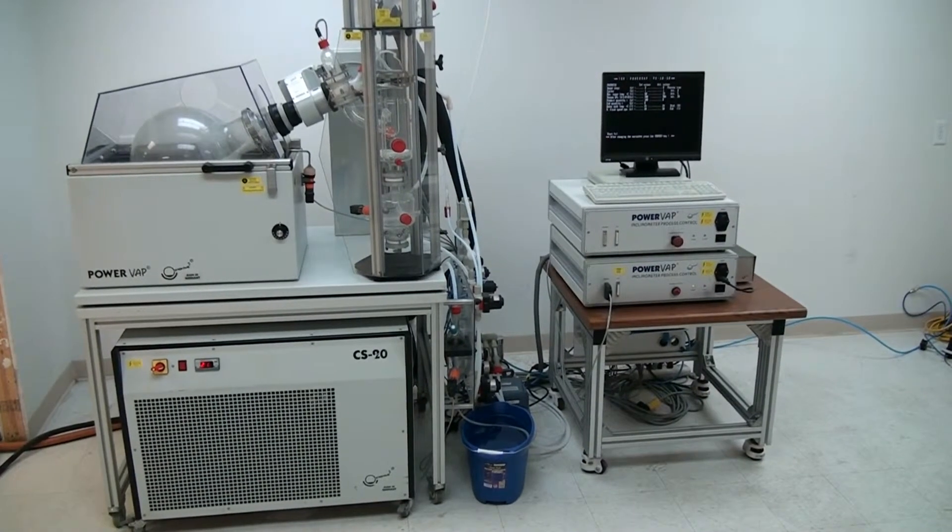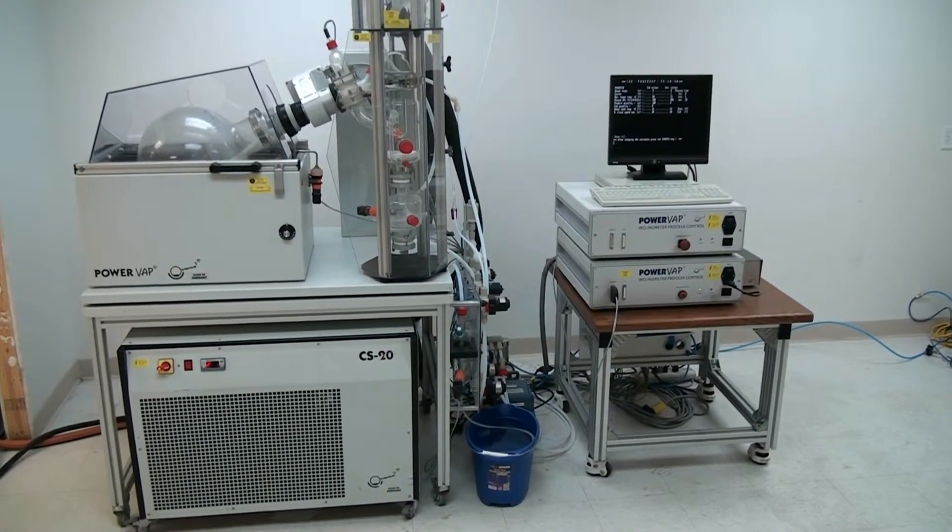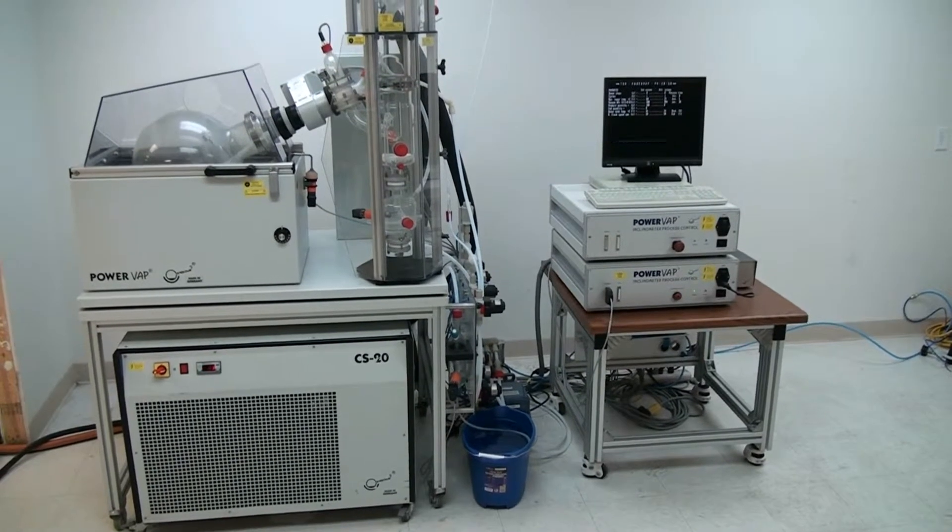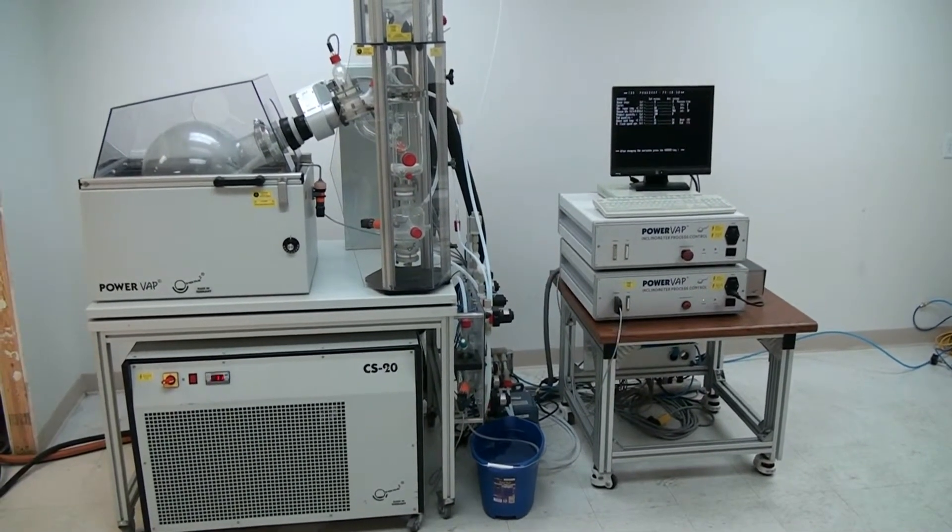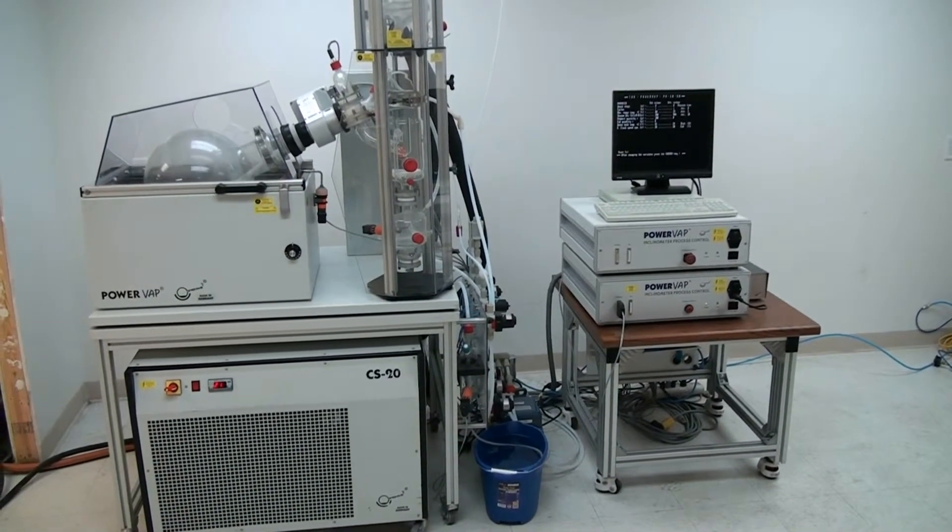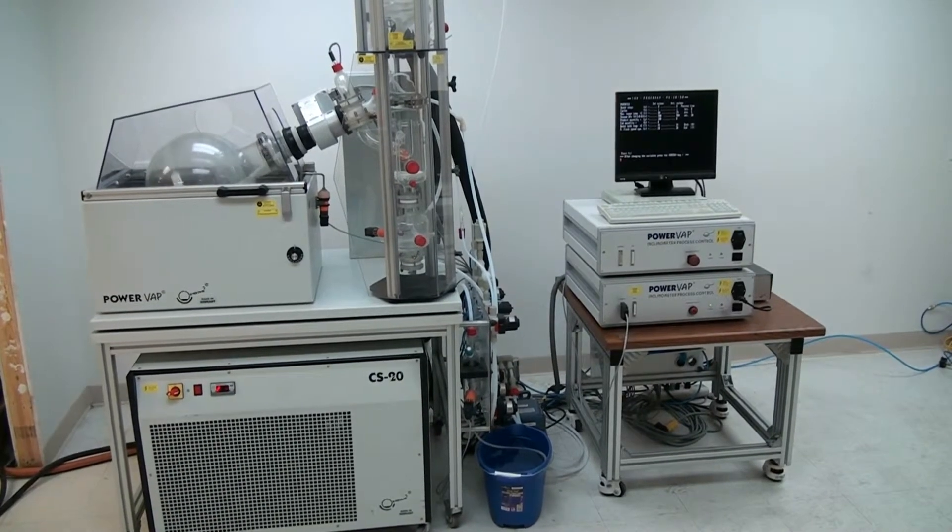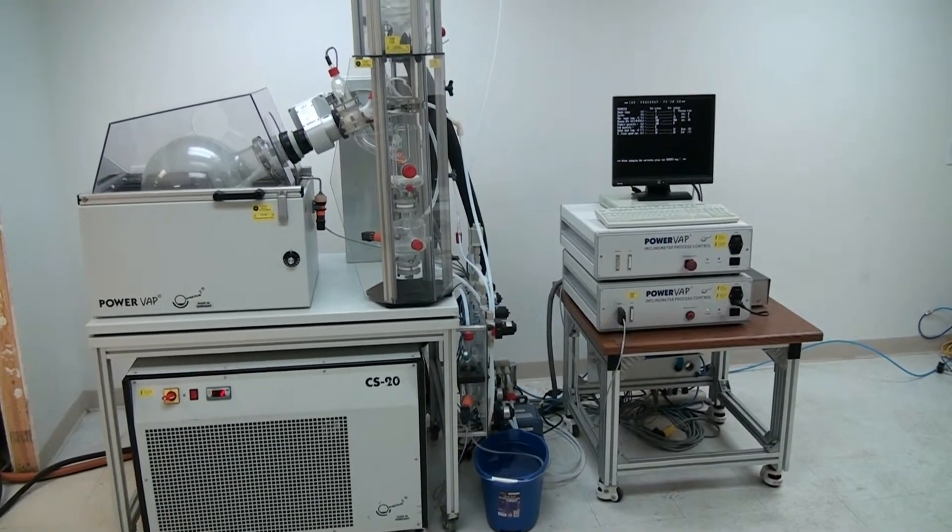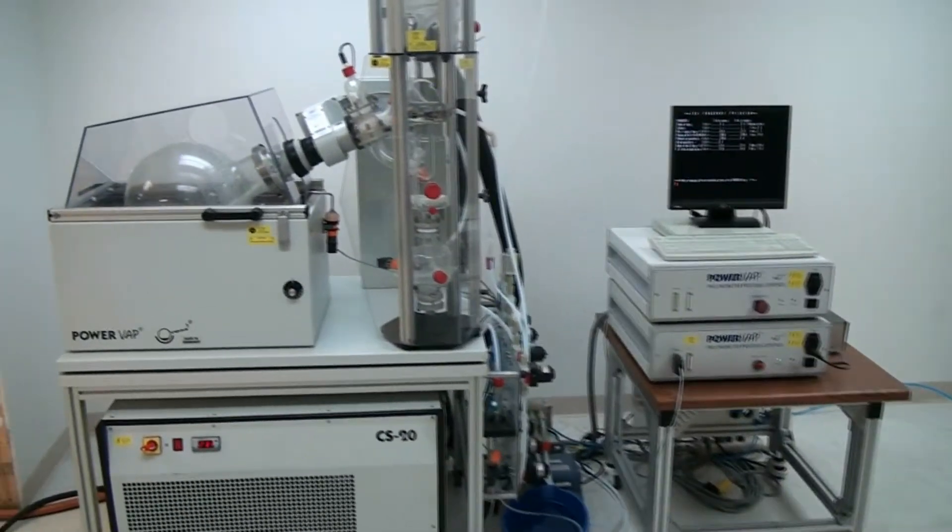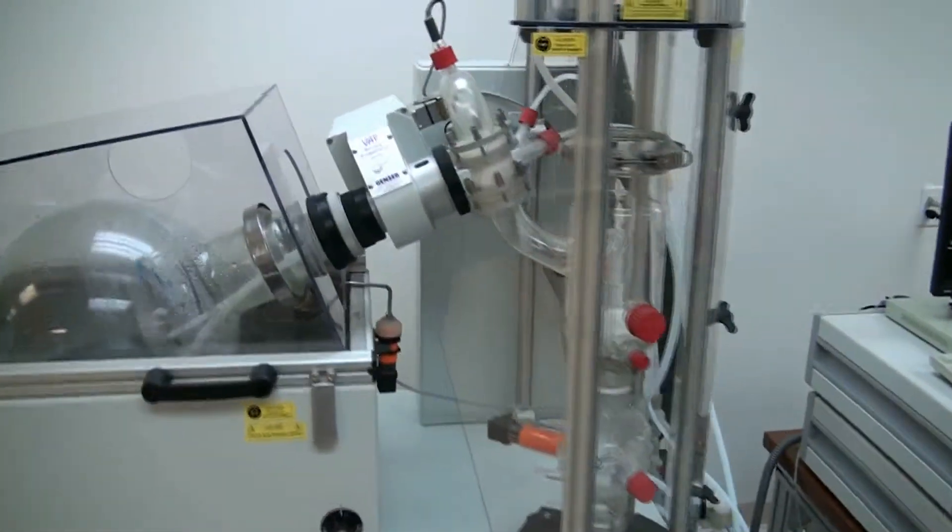Hi, I'm here at New Life Scientific's tech shop and today we have an automated continuous operation rotary evaporator. It's made by Genser Scientific and what's unique about this is that they have a patent on a floating rotating flask that allows for the continuous operation. I'm gonna move up here and explain it a little bit.